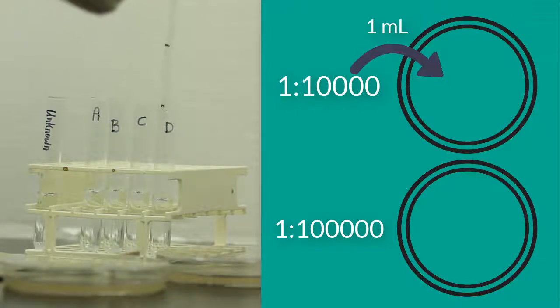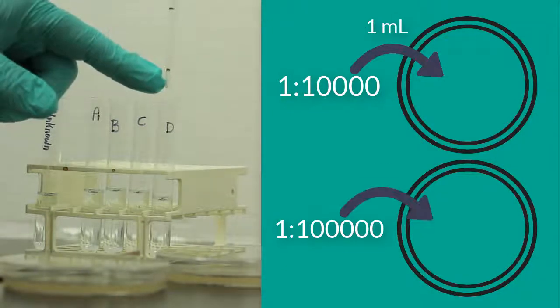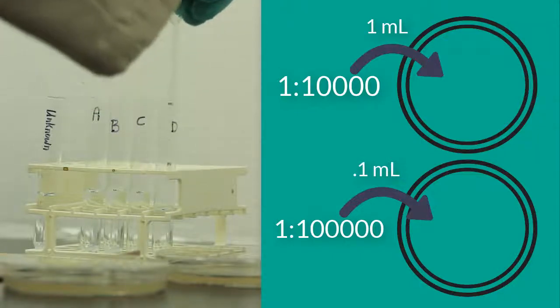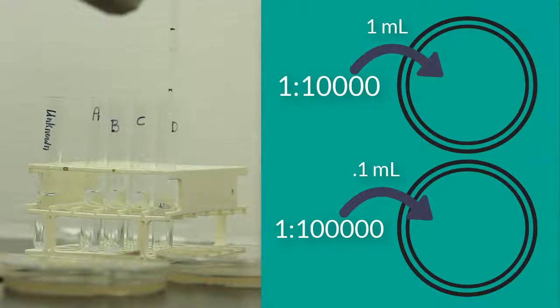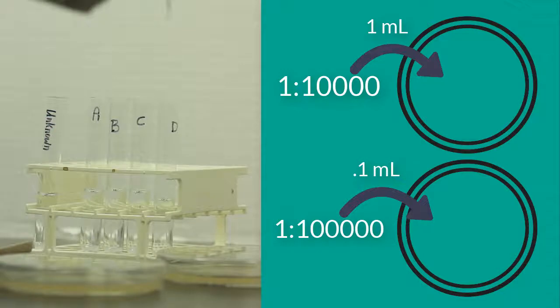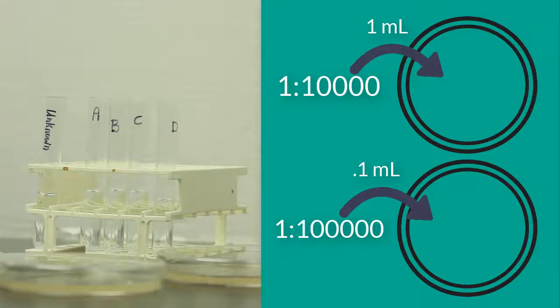For the 1 in 100,000 plate, I need to reduce that by another factor of 10. So instead of 1 mil, I'm going to use 0.1 mil. I'll draw up approximately 0.1 mil, right about there. Placing 0.1 mil on the 1 in 100,000 plate will give me the desired result.